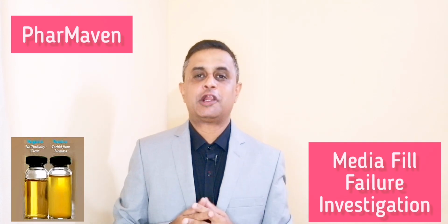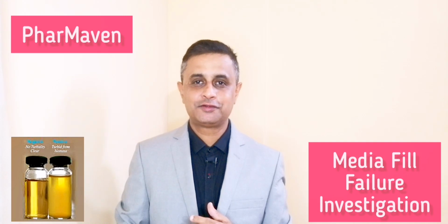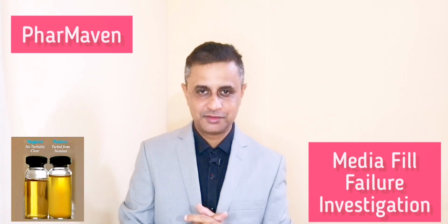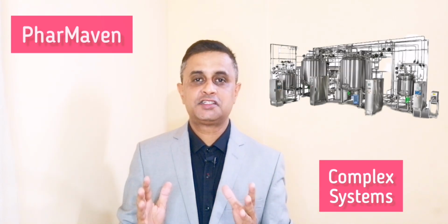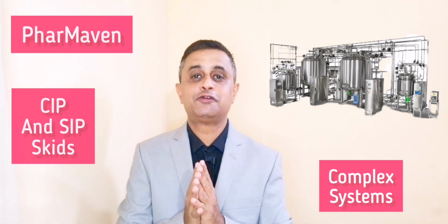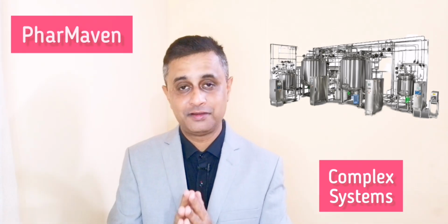With respect to the overwhelming response on my media fill failure investigation series, I am making this video to further explain how to investigate media fill failures. In this specific video, I will be talking about the media fill failures which are associated with a complex manufacturing system. By complex system, I mean where there are SIP skids, CIP skids, and a lot of vessels involved in the manufacturing system. So I will be talking on that part of media fill.